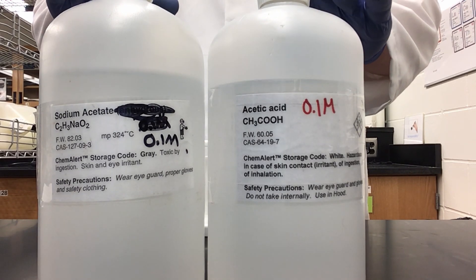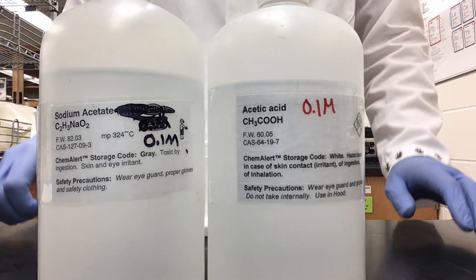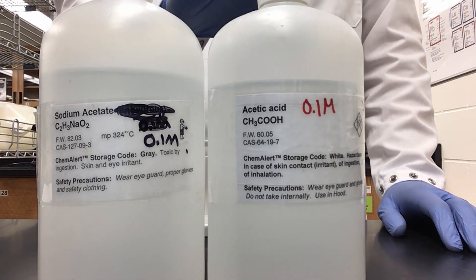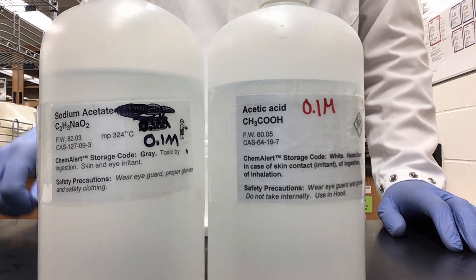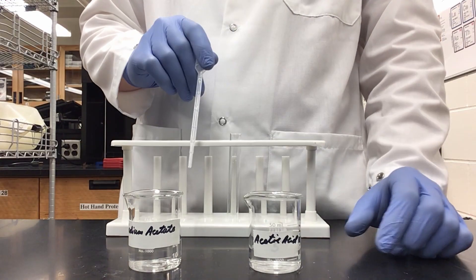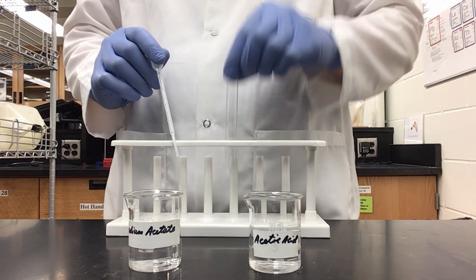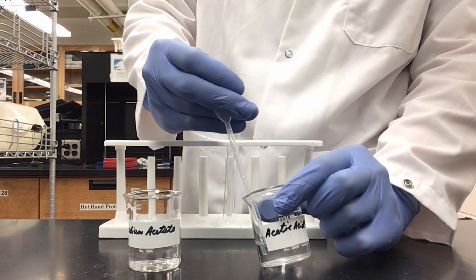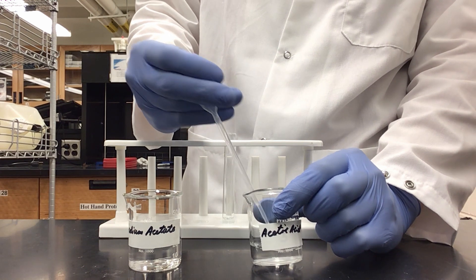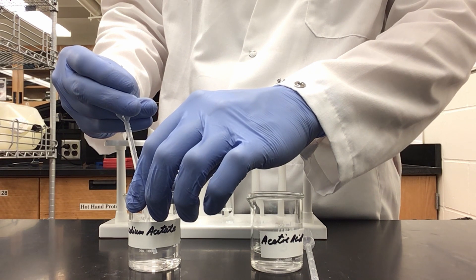To make a buffer, you use a weak acid or weak base and its conjugate salt. I have selected sodium acetate as my salt and acetic acid as my weak acid. Both solutions are 0.1 molar. I've already poured some into each of my beakers. I'm now going to add equal parts into my test tube — I have decided to do two milliliters of each — starting with my acetic acid, then sodium acetate in equal volumes.